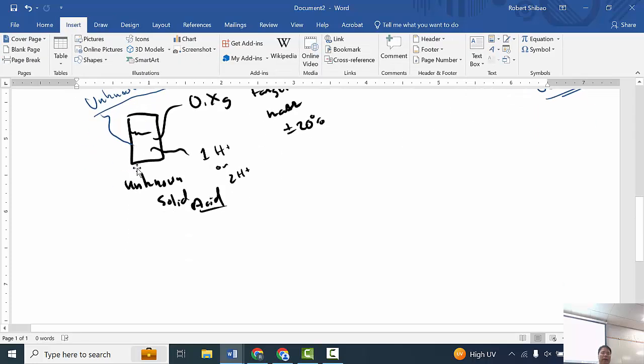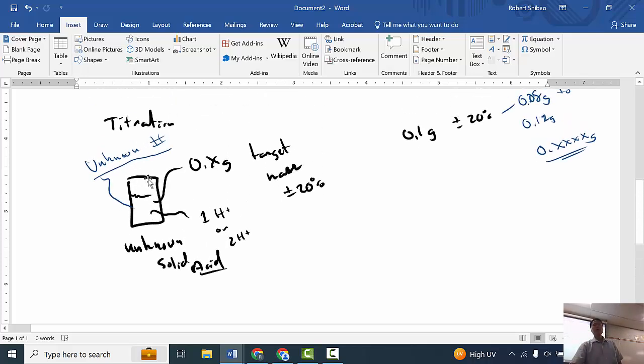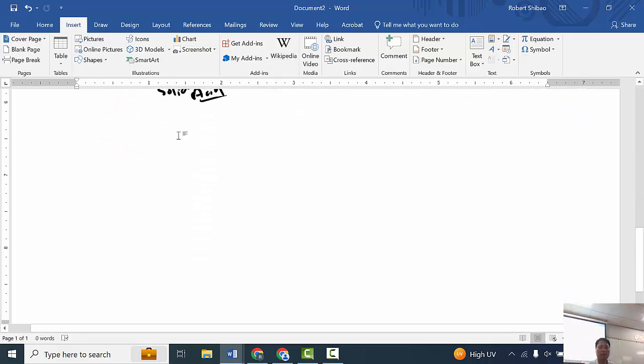So we're going to weigh out 3 or more samples and then titrate it. But in the part 1, we always got the same amount of acid, 25 milliliters. Are you going to get or try to get the same amount of acid this time? Let's say the first sample I weighed out was 0.08365. Are you going to work really hard to get the next sample to weigh that much? No. So what we're going to do is we're not going to use volume.